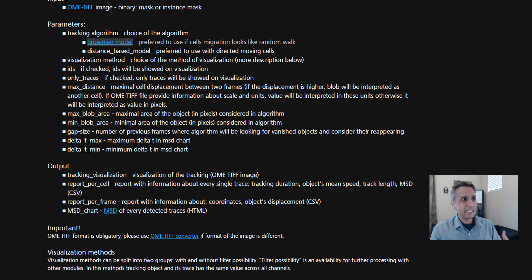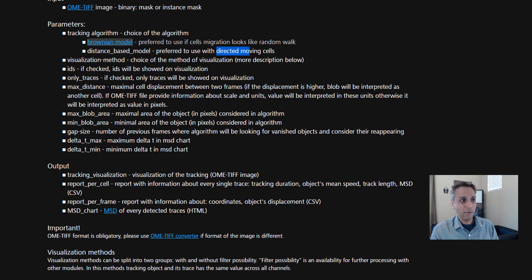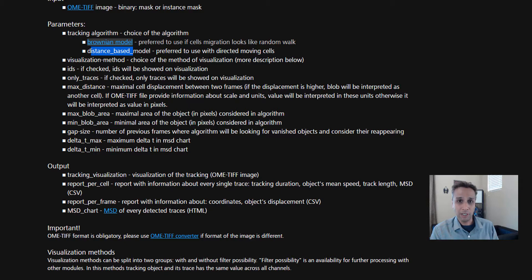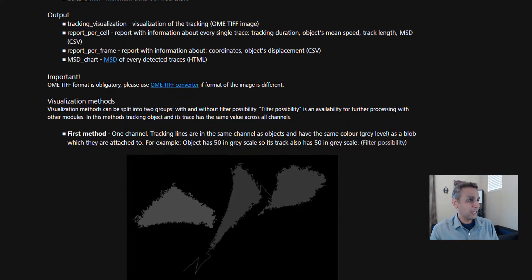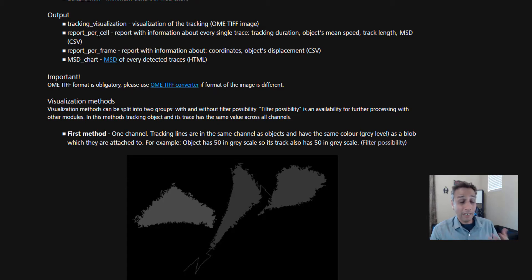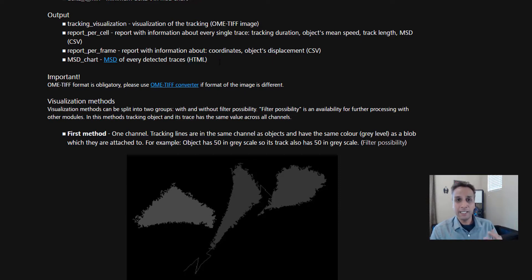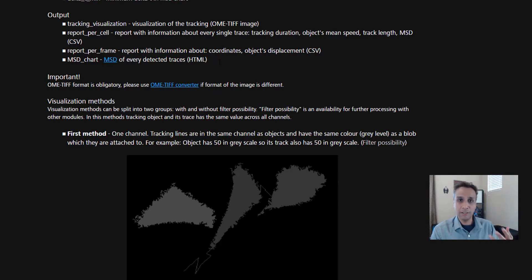As the name suggests, Brownian motion is the preferred method if your cells or objects migrate in a very random walk fashion. If they're migrating with directed movement, we recommend using the distance-based model. For outputs, you're going to get visualization, a CSV file with all the relevant information, a couple of CSV files, and an HTML file that contains plots.